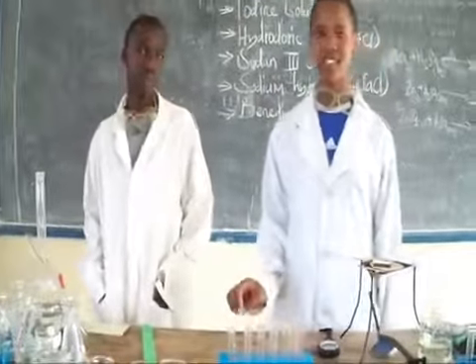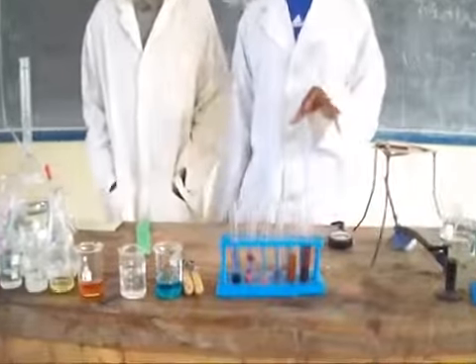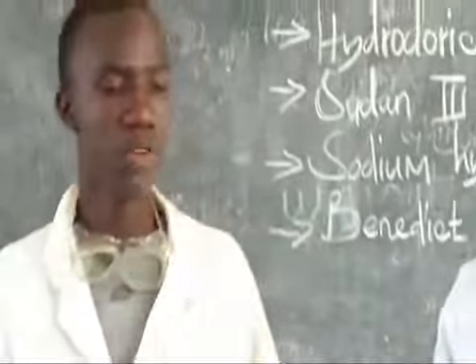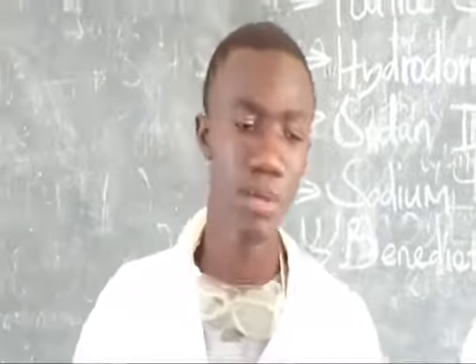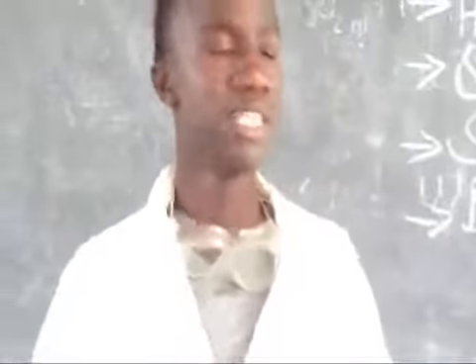Alright, we have now reached the end of experimenting. As we can see, the results are there. We have taken various samples of food. But Kelvin, can you tell us the importance of doing this? I can tell you the importance of food testing. It enables a person to know the required meal for a balanced diet.